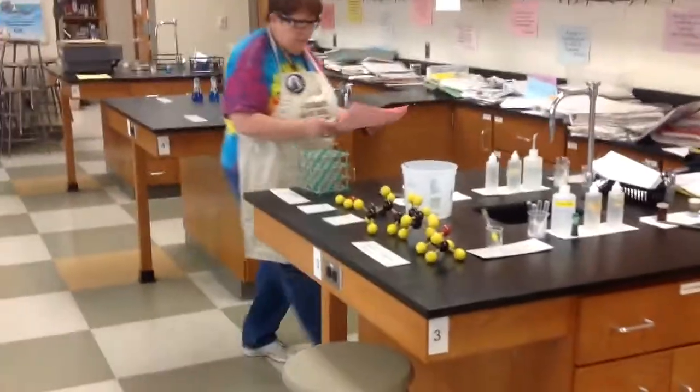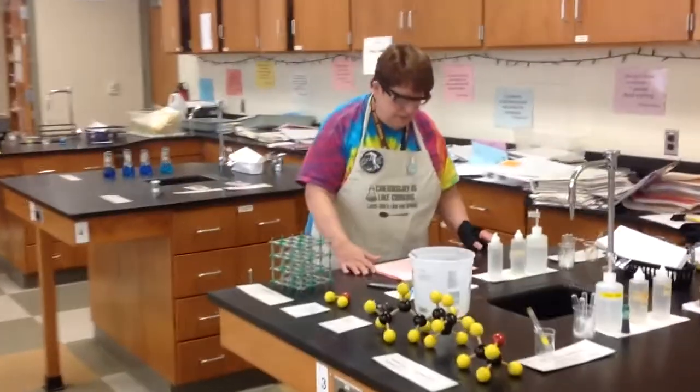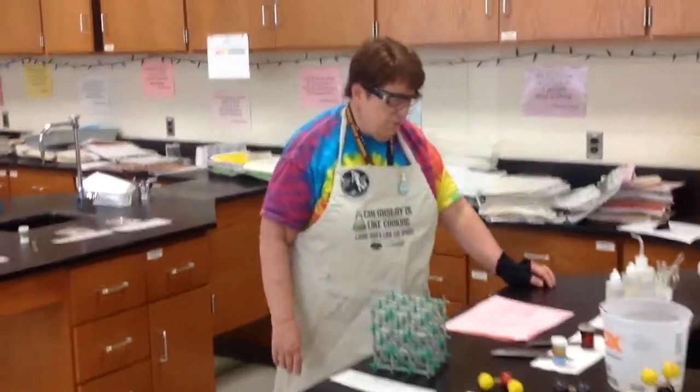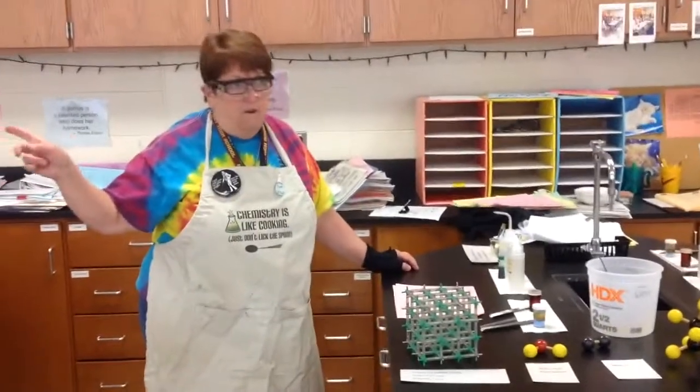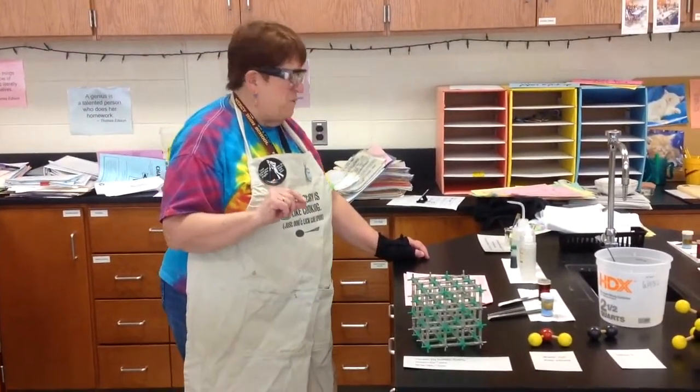Station 3 is at table 3. There's a lot of things to do here. And please, on all these stations where it talks about amounts of things, follow the directions, except where I'm going to tell you right now something different. And I forgot to tell them over there: the colloids, again, your book says they're always heterogeneous. I think they can be either heterogeneous or homogeneous.